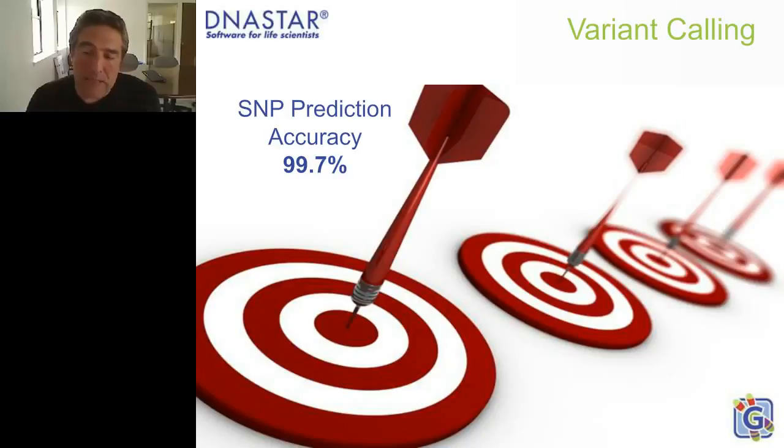What's nice about this is the same assembly and SNP caller and gapping is used for all the different organisms. So if you're working in a non-model organism, you know that this is very, very accurate software, and it's going to do a very, very good job assembling that data.